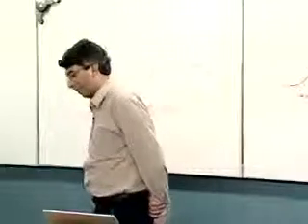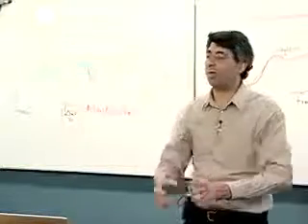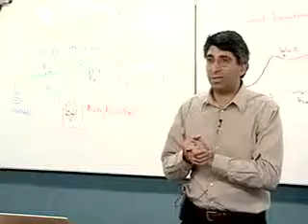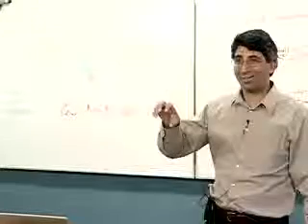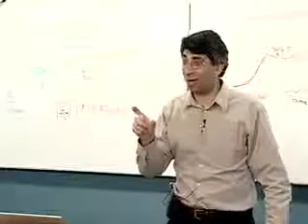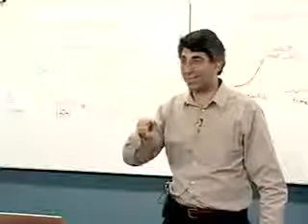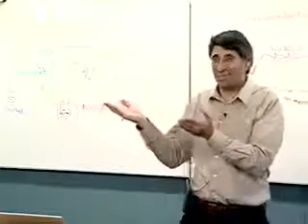If you decide in your electrochemical cell, your cell is close to your... I should point something out. If you use an old 173 potentiostat, it has an external electrometer. And the reason for that is PAR, the real PAR, knew that it was important to have a short distance between the electrometer and the reference electrode, because if you put a long wire in, there would be a resistive loss there that your most sensitive electrometer would say it's part of the system.